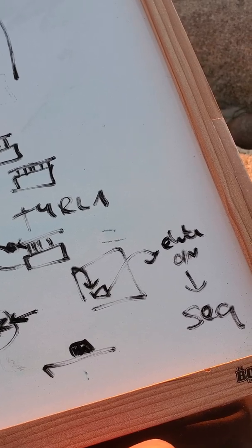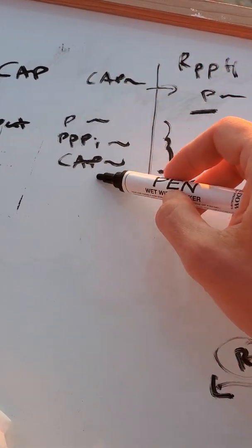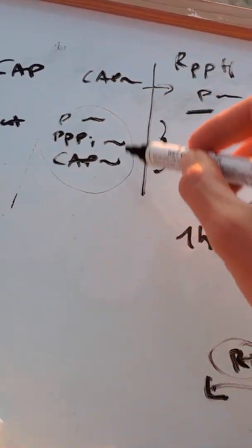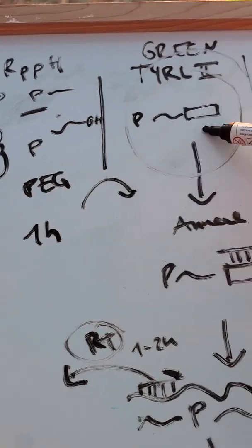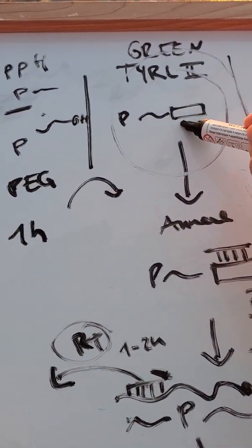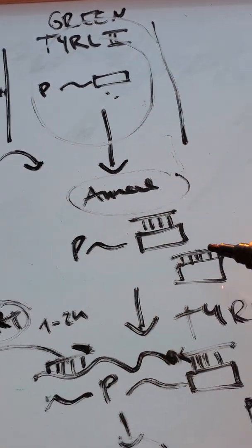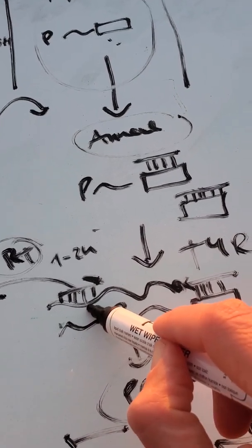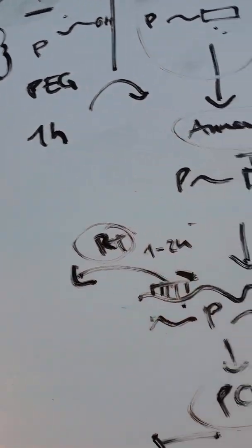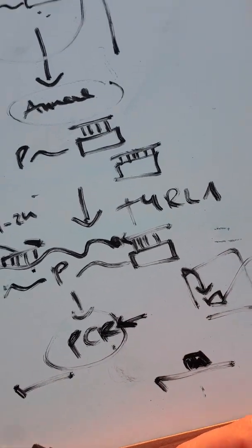So I thought I'd just keep repeating that we basically have cap and input. And for input, we just use 50% of our master mixes. Master mix 1 is decapping. Master mix 2 is adding the 3' adapter. Then we use the PCR machine to anneal the primer. Master mix 3 is to add on the 5' adapter. Master mix 5 is for reverse transcription. And master mix 6 is to make the PCR. And with understanding that, tomorrow will not be too stressful.